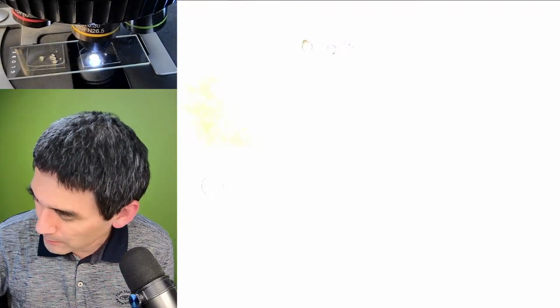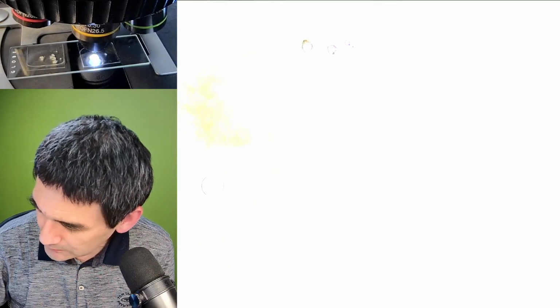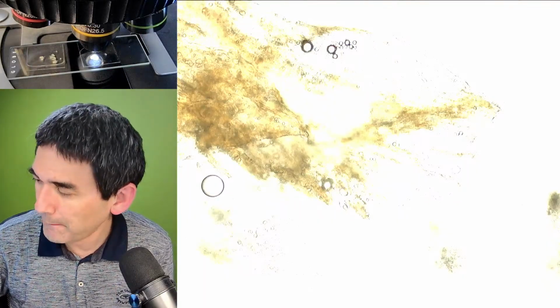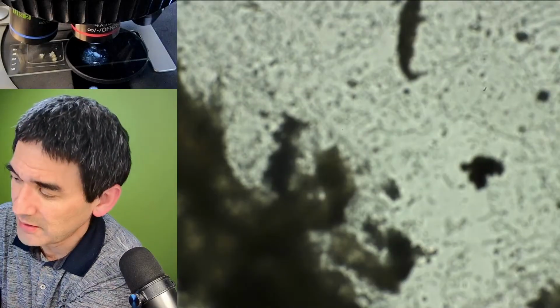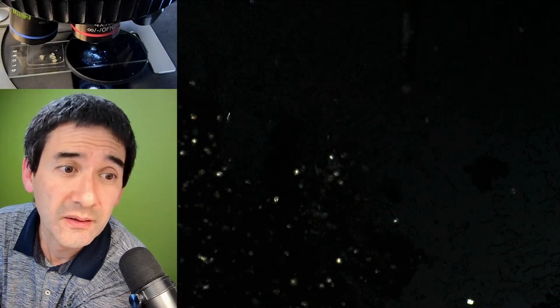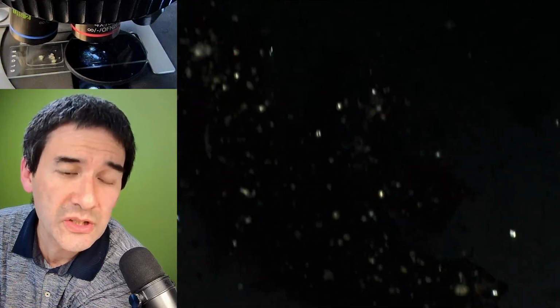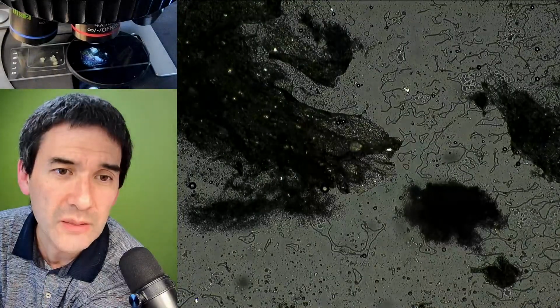I put a normal polarization filter here on the bottom, and one on top. I'm going to now use the 4 times objective. It's now moving because the filter is touching. I'm now rotating the filter, and that's basically how it looks in polarized light. You see, sometimes it starts to shine up, but let's give it a little bit so that we're able to see it better.